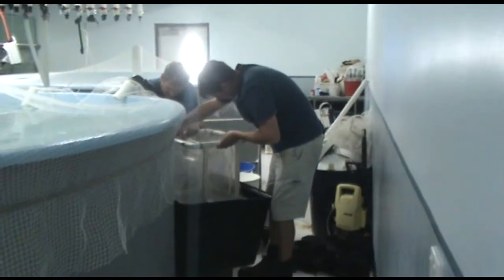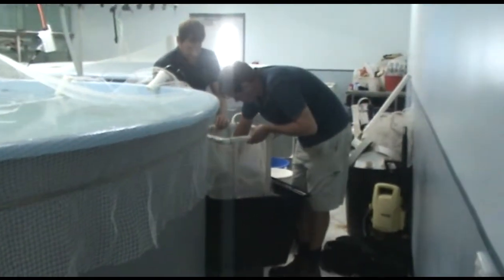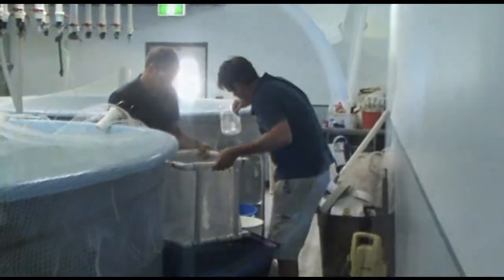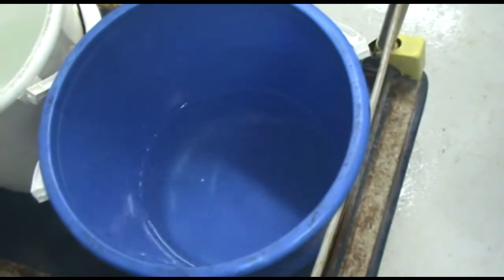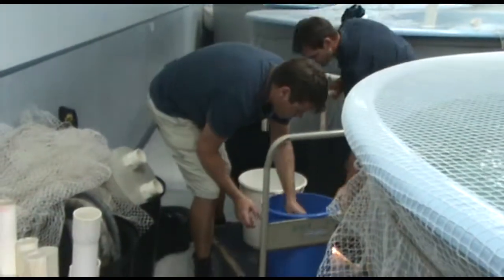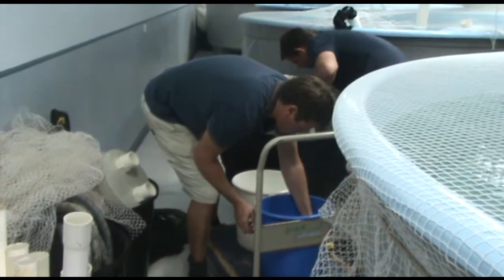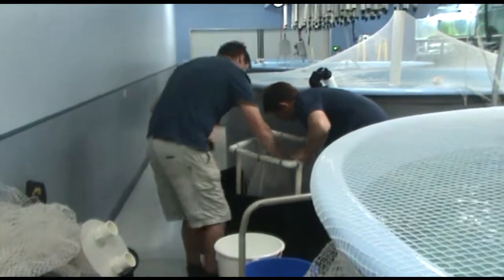Scoop eggs out of the basket with a beaker or similar container for transfer into a bucket and then to an incubation tank. Fill the bucket to a known volume for a later calculation of the number of eggs in the bucket and for calculation of fertilisation rates. Counting of eggs is described in the egg incubation tank management video.